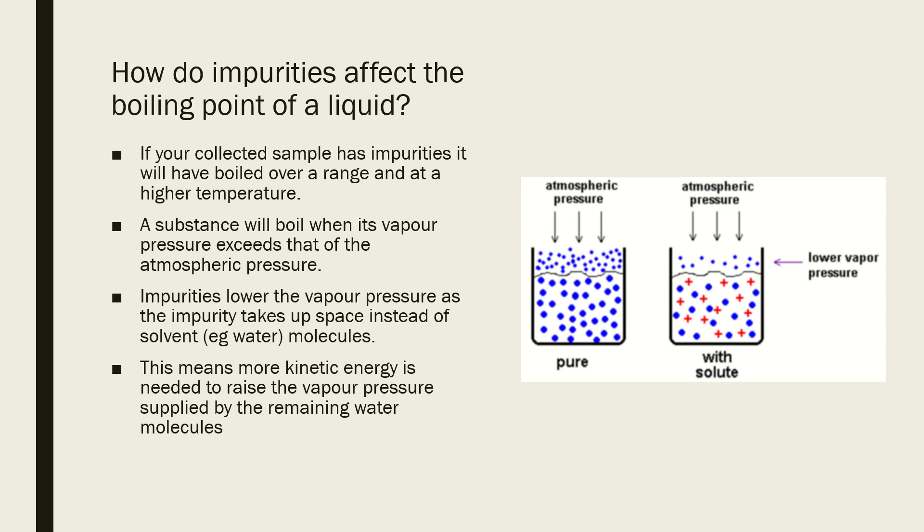Now the pure substance, you can Google the true boiling point for that, and if you've managed to get it exactly the same in class, then obviously you've made it very well. Typically, however, you will get a boiling point that is higher than the true substance value. So we're going to be going through the reason for this and how the impurities have actually affected it.